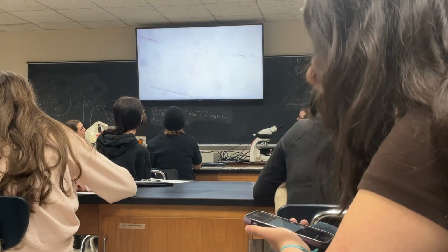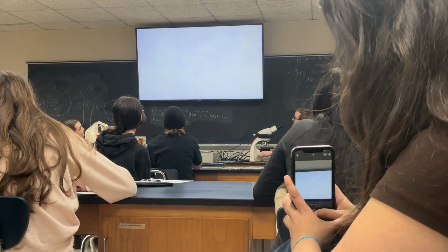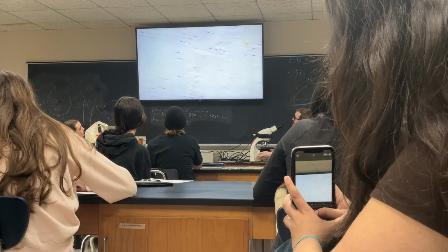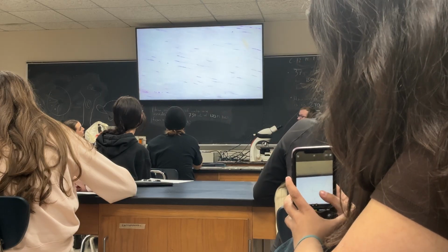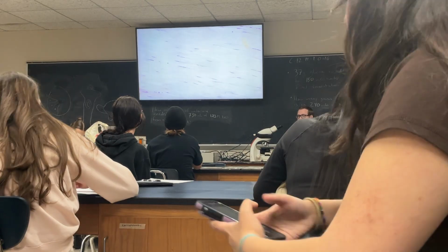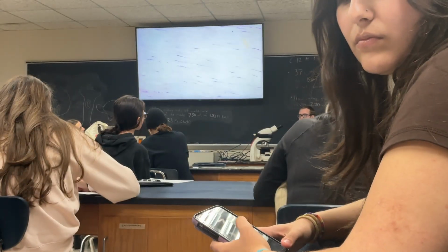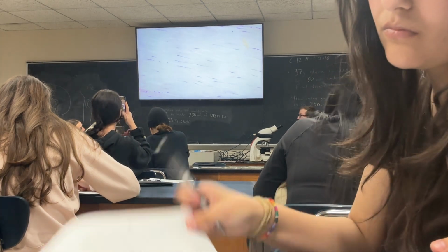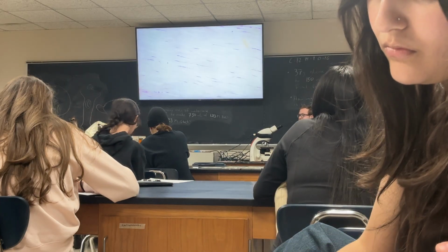What type of tissue do you think this is? Okay, so our obstacle right now is to be able to tell the difference between dense regular connective tissue, smooth muscle, and fibrocartilage, because all three of those look pretty similar to each other. This is not muscle, but I do agree it kind of looks like smooth muscle. So we're going to have to figure out how to tell the difference between those.